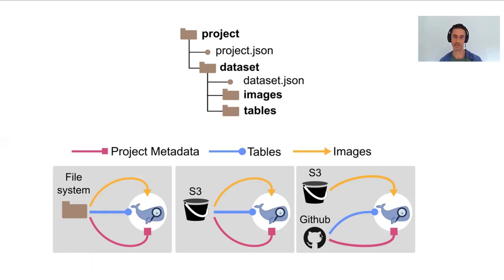And this is, we think, very practical, because we quite often change JSON files and the tables, and this is nicer on GitHub because you also have versioning, and it's just a bit more accessible than the object store. So this is a modality that we currently mainly use. But you can't put big images on GitHub, right? That's why we have them in the object store.